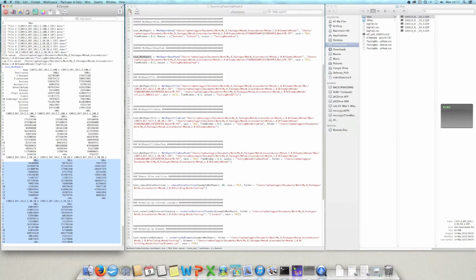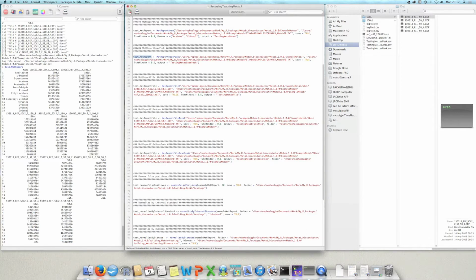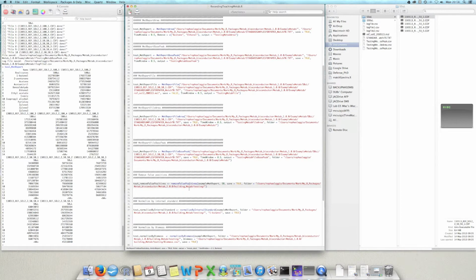They have a fragmentation very similar to xylene 2. So probably they are identifying the same peak, I'm not sure. But the idea is that it was found in only 1 sample, and I don't consider that a true compound. So this function filters these results, keeping only the compounds that were found in a minimum number of samples.